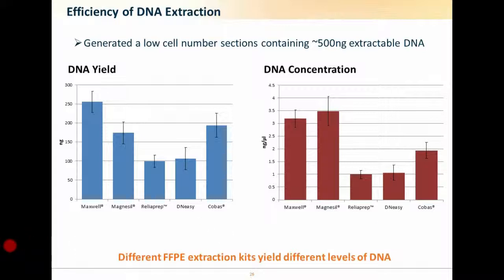What I think is important and useful for molecular labs is always to understand the properties of the kits, and what we find in our lab is that the column-based methods, like the QIAGEN column-based methods, are more variable between different people, but often they're very consistent within the same person running the same kit.